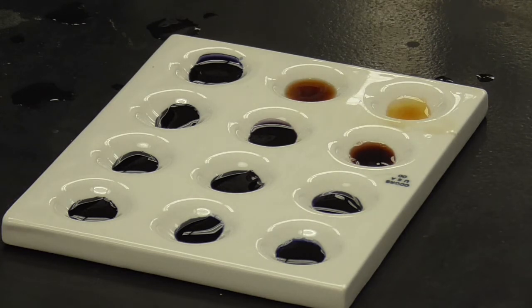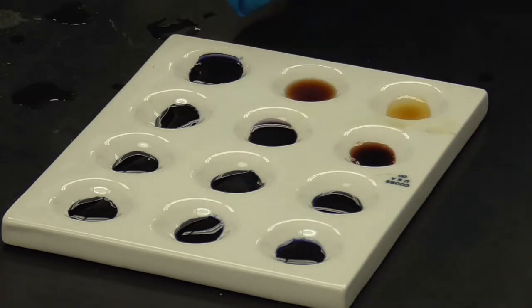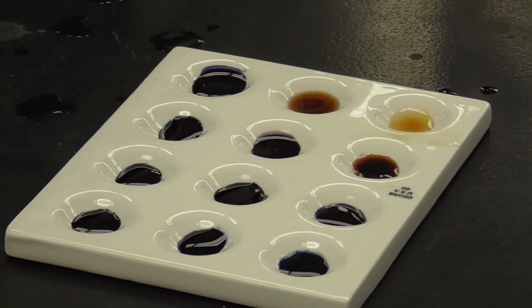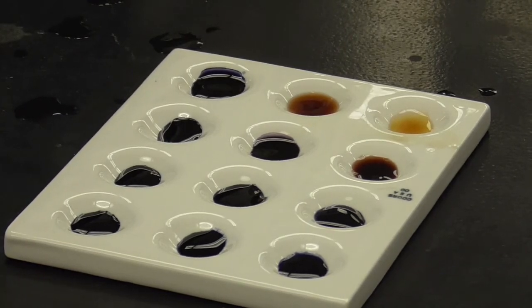So the amount of enzyme that's present, 0, 2, 4, 6 drops for each column, really makes a difference for 0, 5, and 10 minutes on ours. So make sure you get that copied down, the data. And again, you want to score each one of these wells as either a 0, 1, 2, or 3, depending on how much enzyme activity we see evidence of.